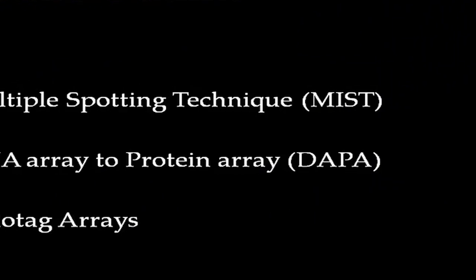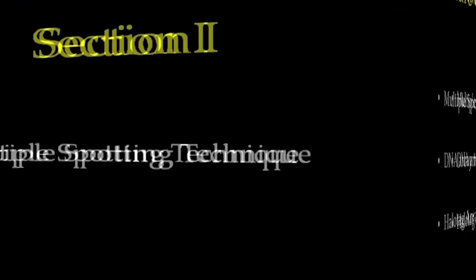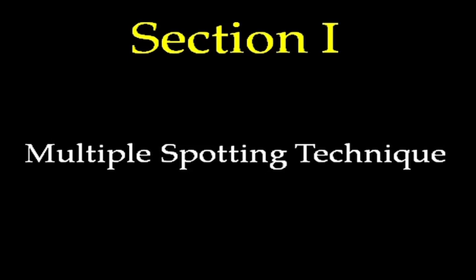Welcome to MOOC Interactomics course. In our previous lecture, we discussed two cell-free expression systems, protein microarrays, namely protein in situ arrays and nucleic acid programmable protein arrays, PISA and NAPA. Today, we will talk about the multiple spotting technique.